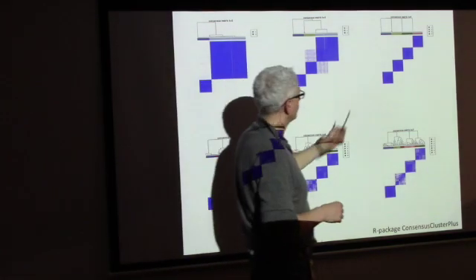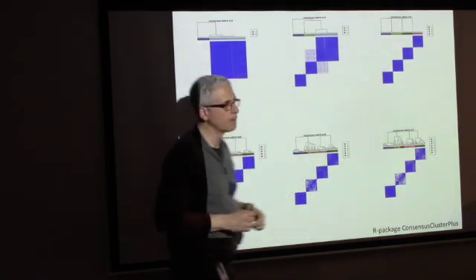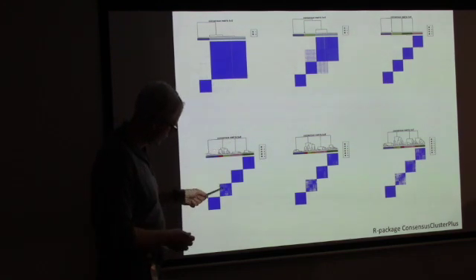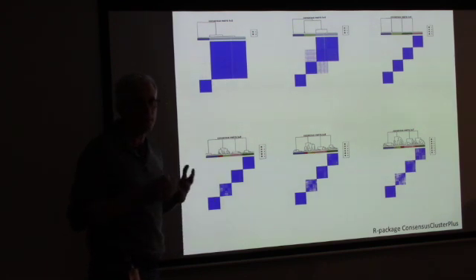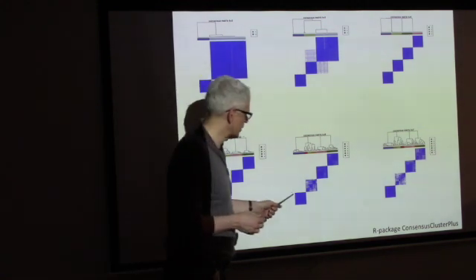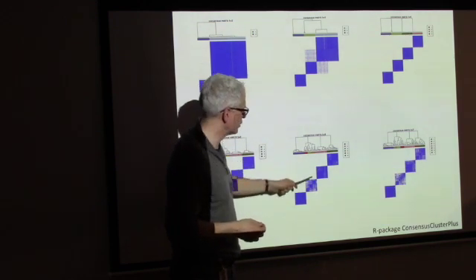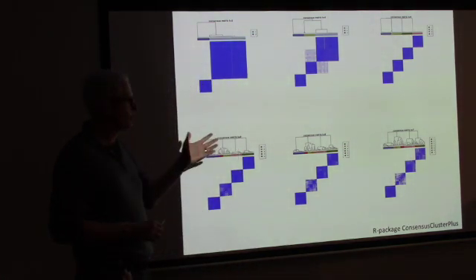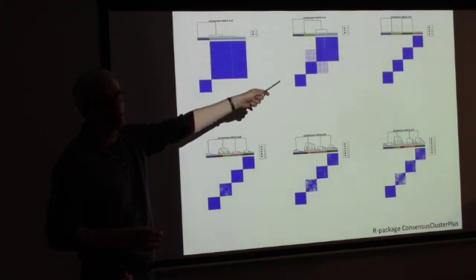When I ask it for 4, I get a good solid 4. So it's either white or purple. When I go on and ask it for 5, you can see there's some confusion here, but it's still sticking with 4. It won't give me the 5 I asked for because there's just no 5 in the data. And same here, when I ask it for 6, it's messy, but if anything, it looks like 4, and when I ask it for 7, it looks like 4. So this is telling you quite clearly the answer is either 2 or 4, and 4 is even cleaner than 2.